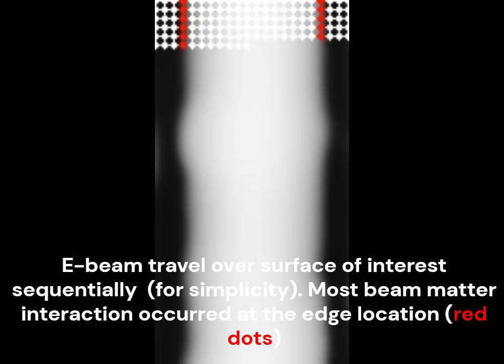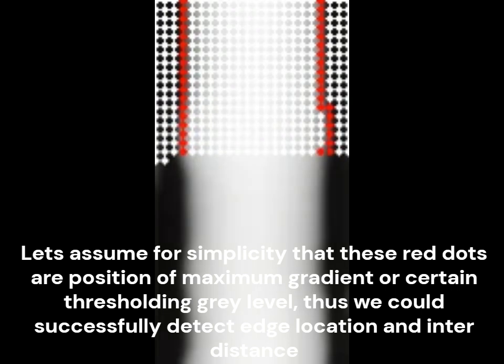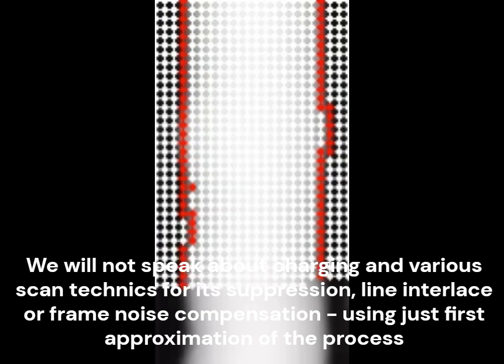Most beam matter interaction occurs at the edge location, red dots. Let's assume for simplicity that these red dots are the position of maximum gradient or certain thresholding gray level. Thus, we could successfully detect edge location and interdistance. We will not speak about charging and various scan techniques for its suppression, line interlace, or frame noise compensation, using just a first approximation of the process.